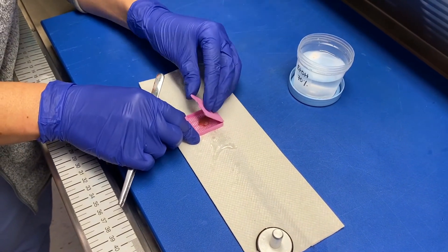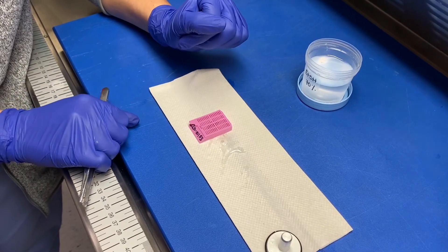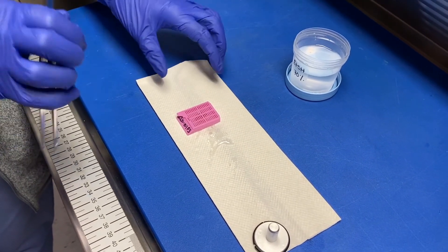Once all is complete, close your cassette and put the cassette in formalin fixative as you would any other tissue in a cassette.